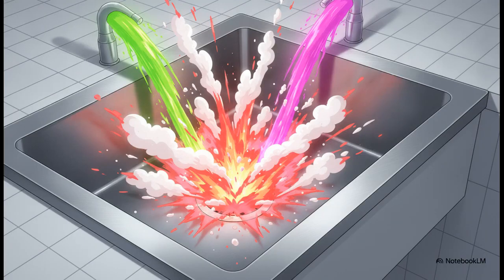And here is a critical point for cleanup. Never mix acidic cleaners, like nitric acid, with alkaline cleaners, like sodium hydroxide. Doing so can trigger a violently dangerous, highly exothermic reaction right there in your sink. Remember, safety doesn't just stop because your data collection is over.